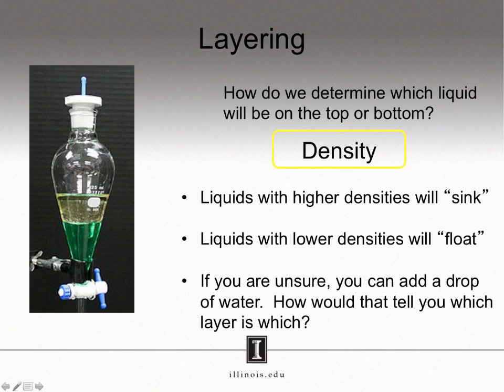In contrast, most other organic solvents tend to be the top layer in an extraction because they are less dense than water. So remember that rule of thumb. Chlorinated solvents, more dense, bottom layer. Everything else, less dense, top layer.